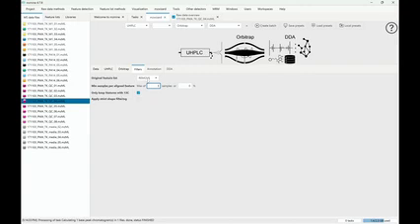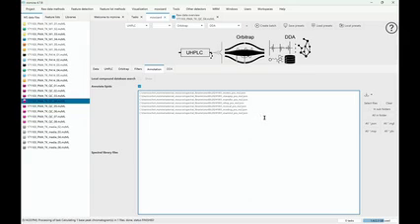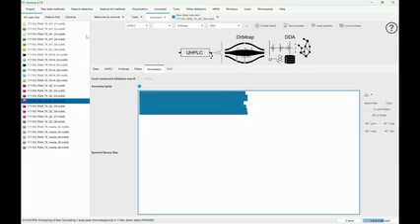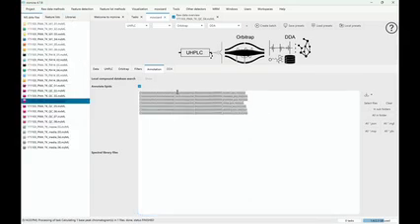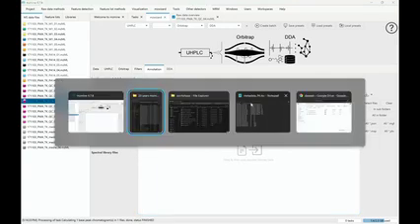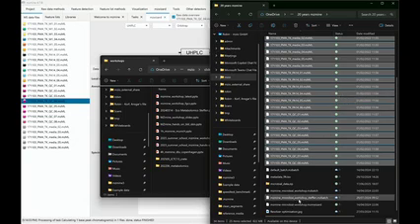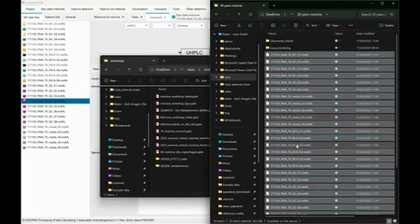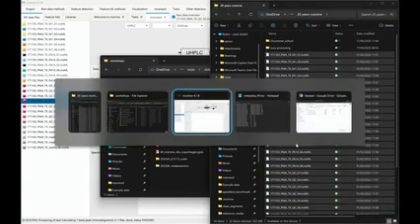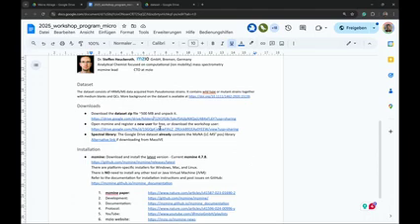And then in the annotation, I did send some different libraries, and this is actually the wrong ones. Oh my God. Yeah, I already updated this on my side. So I have to find it as well. Let's see. So I did send you a JSON file, right? Let me see. What did we do?